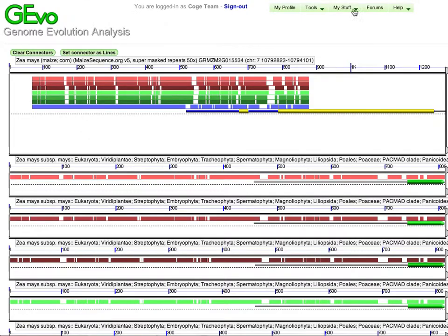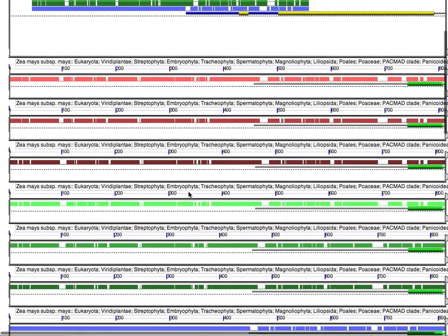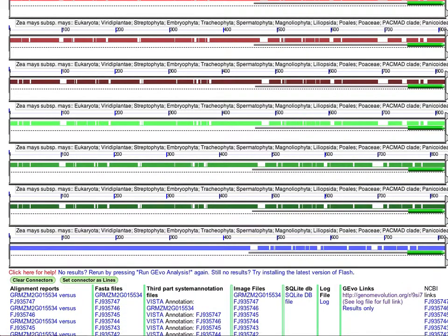We can do similar kinds of analyses taking a look at various accessions of maize by stacking all of these on top of one another. Here, our region of sequence similarity is colored so that we can quickly identify those that are common or divergent between these various accessions in order to identify those putative regions that may be regulating differences in gene usage between these particular accessions.